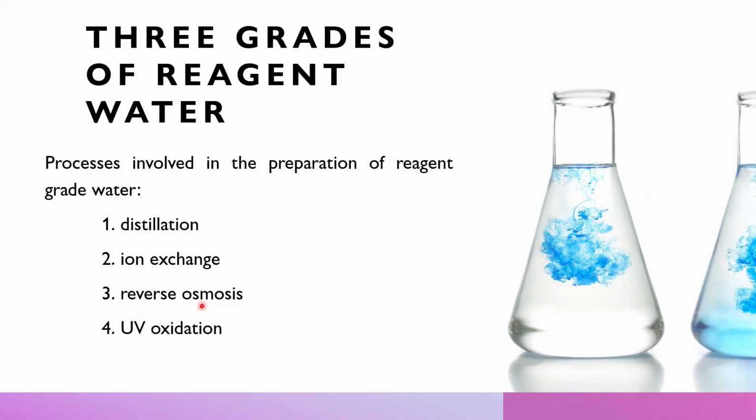Okay? Water can also be purified by ultrafiltration, ultraviolet light sterilization, or ozone treatment. But actually, class, the laboratories generally call for the use of reagent grade water.